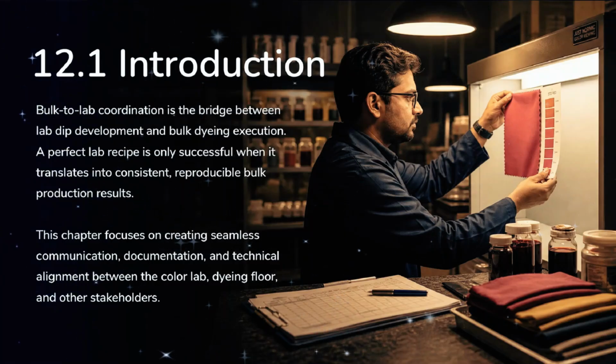Bulk-to-lab coordination acts as the essential link between the lab and production. Success relies on seamless communication, precise documentation, and technical alignment, ensuring that the lab's approved color recipes are replicated perfectly in the bulk dyeing process.